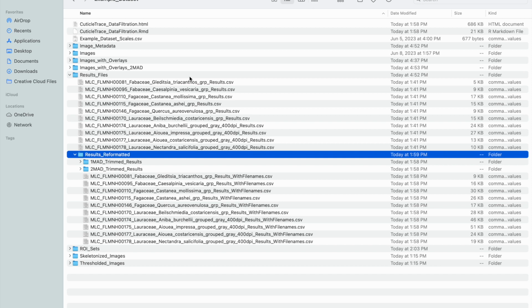To go deeper into that, go to section 4 of the CuticleTrace user manual. That should have in-depth information on everything you need to know for that. But basically, it is best to just try things and visualize them and work with it until you receive results that work for you. So thank you again for this, and good luck.